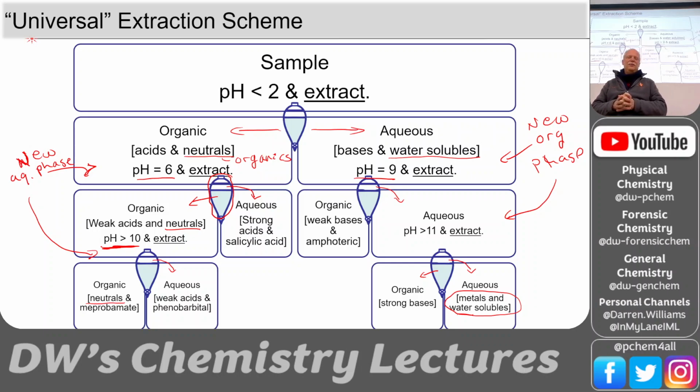It does 2 bad things. One, it forms peroxides, and so you got to use it or lose it, right? Forming peroxides in the bottle is really bad because a lot of times it forms when the ether evaporates. It's evaporating through the lid, or you pour it a bunch and you get it in the lid and the threads. It forms peroxides in there, and then they're contact or friction explosives. And so you open the bottle, and that scratchy opening of the bottle can cause it to pop.